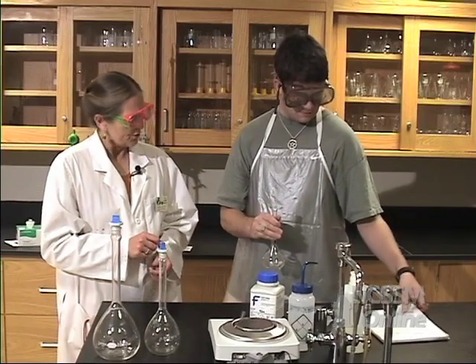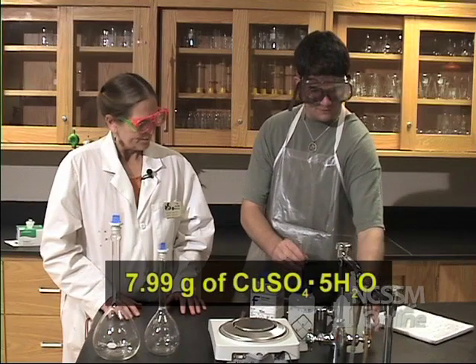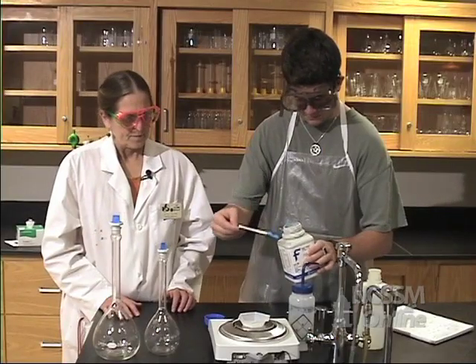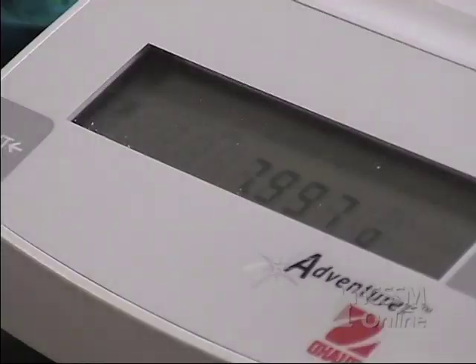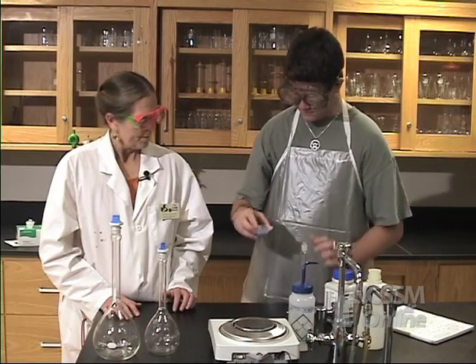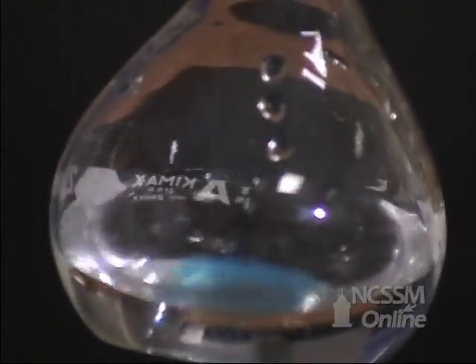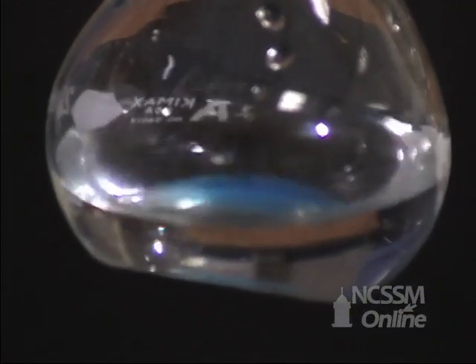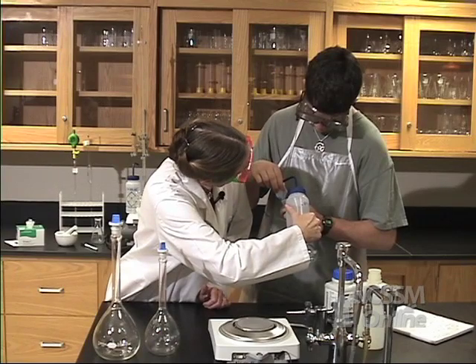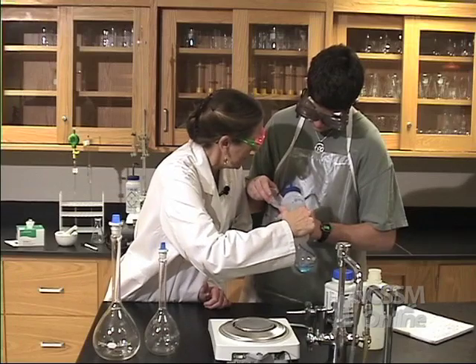So how much copper sulfate did you calculate that you needed? I needed 7.99 grams. First I'll pull the water, and that's 7.99 grams. Now when you have all the solid in there, I can just add a little water and it'll go smoothly. We want to rinse to make sure that we get every drop of the copper sulfate into your volumetric.